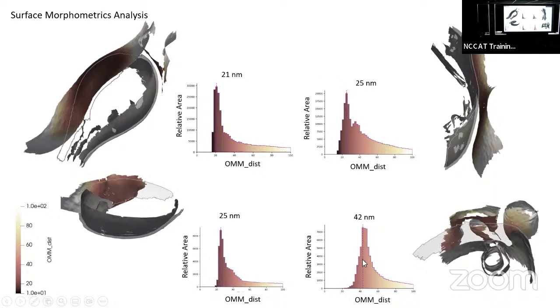sites. Previously, people only looked at volume EM images, and you really cannot quantify this distance like we have done here. That's a big plus of doing high resolution tomography: you can now zoom in and really characterize the distances. Instead of the roughly 30 nanometer distance in the literature for ER-mitochondria distances, now we can see that it's actually more heterogeneous, and there's a lot more going on.